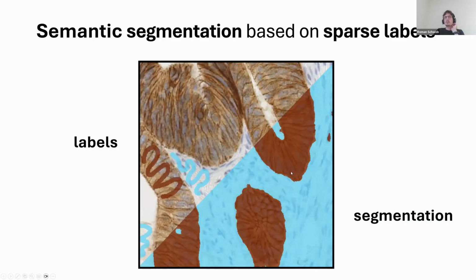What's important with semantic segmentation is to differentiate it from instance segmentation. Semantic segmentation is about differentiating parts of the image that represent different types of objects or texture or whatever, not separate instances. So that's important to realize, and Convpaint is aiming at doing semantic segmentation.